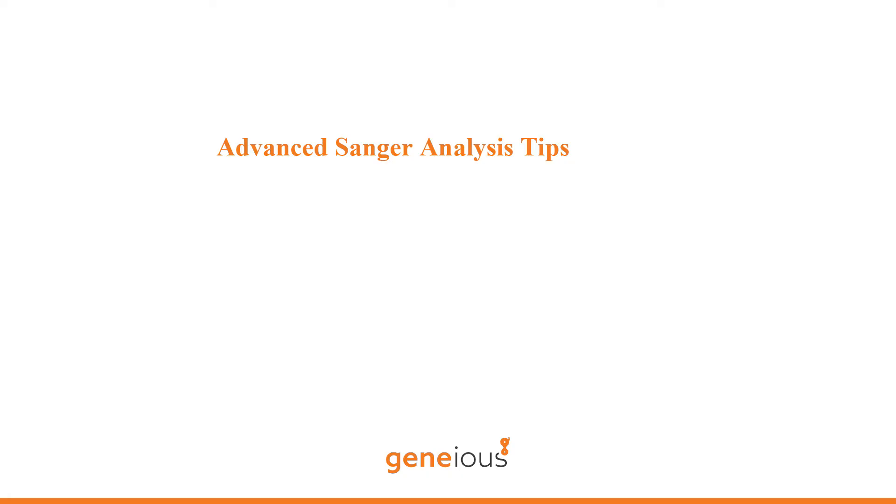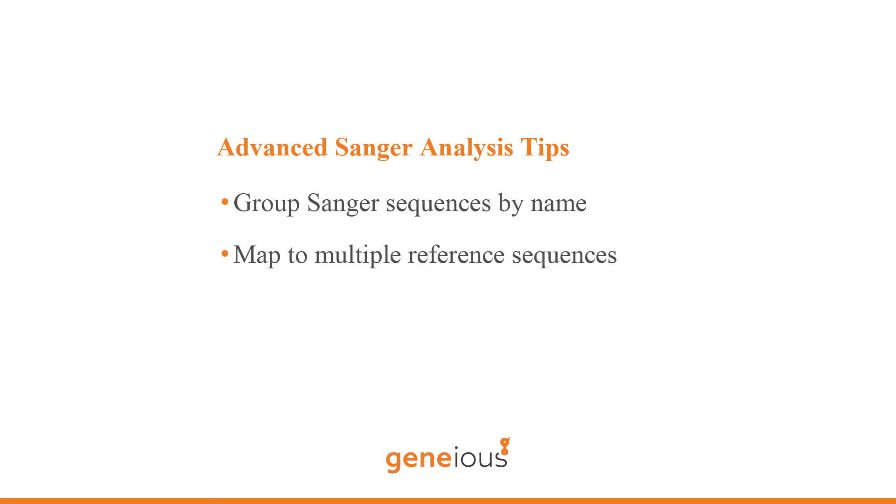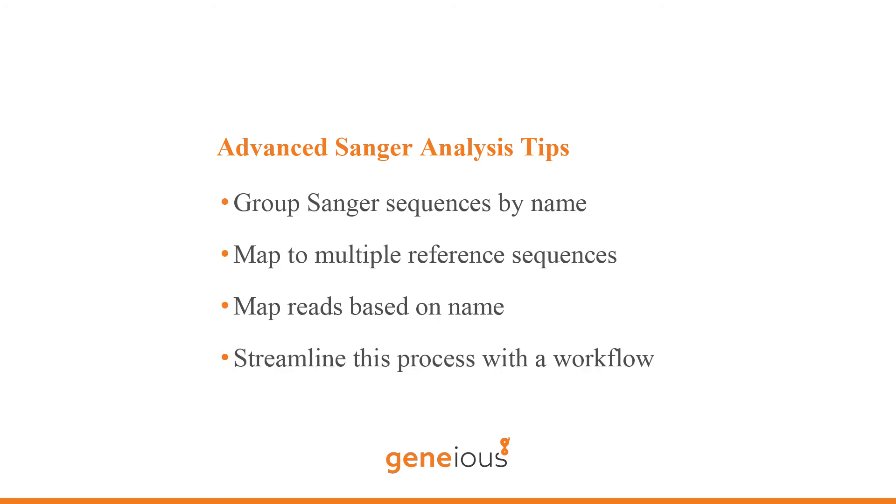Now that you know the basic steps to chromatogram analyses in Genius, here are some additional ideas to help you take your analyses to the next level.